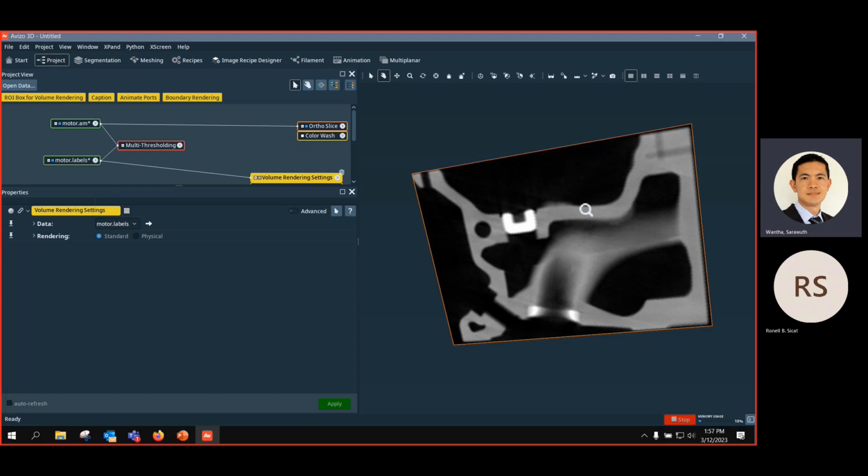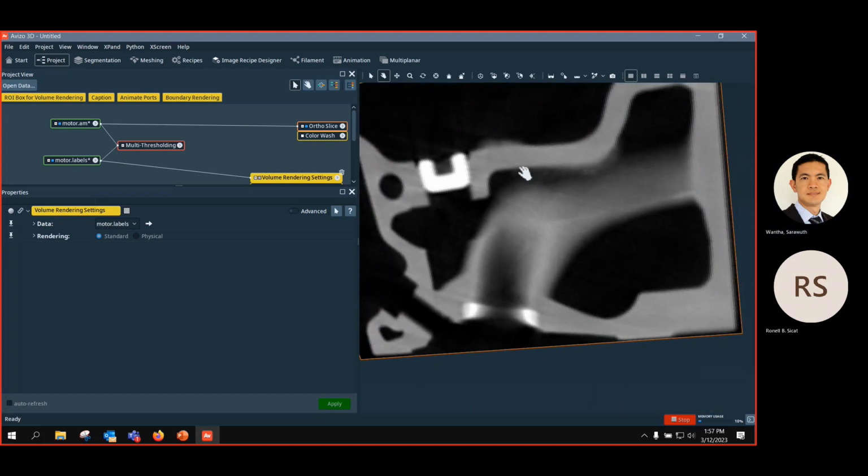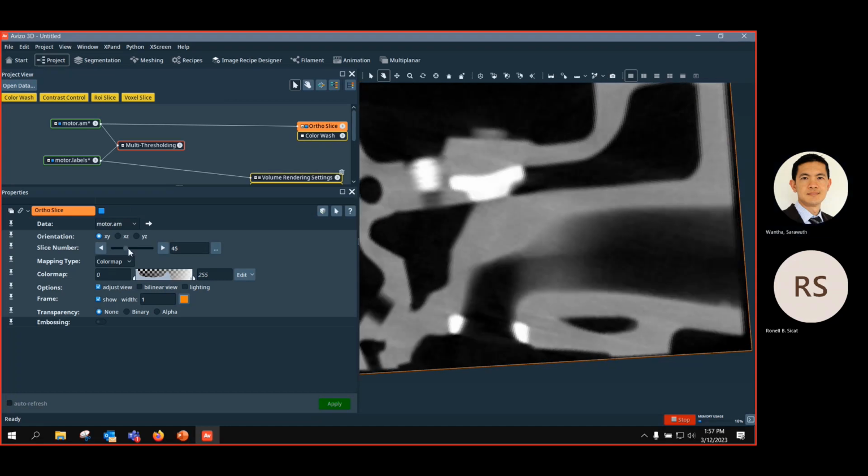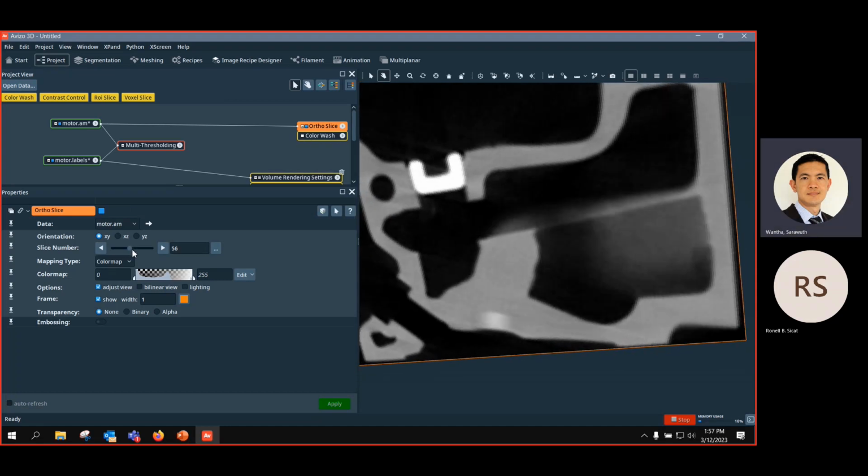Yeah. Exactly. For example, here, it depends on how you interpret them. Some people can say that okay, even these two materials have different intensity but are the same material. So instead of having more ranges, you just have a bigger range that covers both the dimmer and brighter, so only the brighter material is one material. So it's how you define it when you create this multi-thresholding.